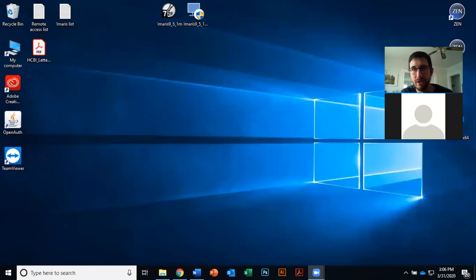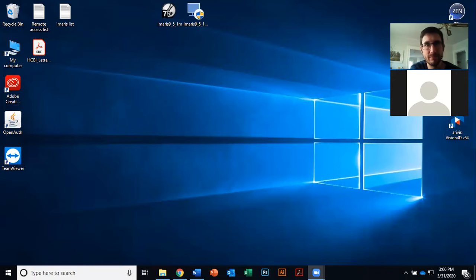So hopefully you can all see my screen now, can you? Yes.